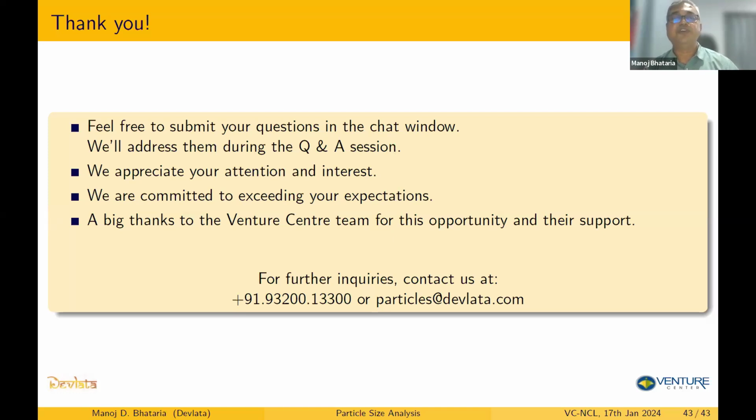So you have to stop. You have to do the analysis at the concentration before that. The highest possible concentration where you are getting a stable size, right from lower to the highest. So that is the optimum concentration at which you are getting a stable size without any multiple scattering. So that is the optimum concentration.